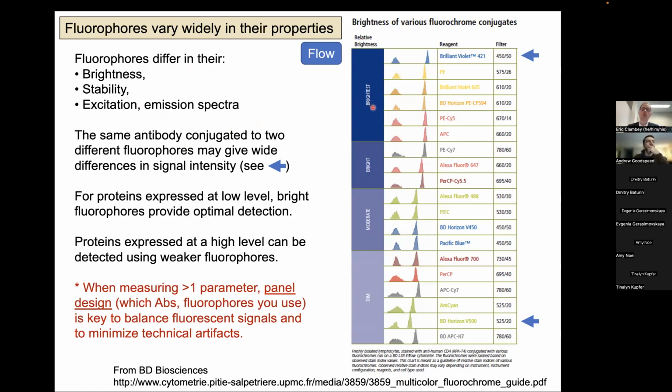I think one critical concept here is that the exact same specificity of an antibody, if it's conjugated to two different fluorescent molecules, can give you very different measures. So if you compare this top blue arrow versus this lower blue arrow, here, this is an extremely bright fluorophore, and all these different analyses here are with the same antibody, but you can see a very large distinction between your positive and negatives. In contrast, the same antibody specificity simply conjugated to a different fluorescent molecule down here, while you still have a positive and negative, the difference between those is greatly reduced. Okay.